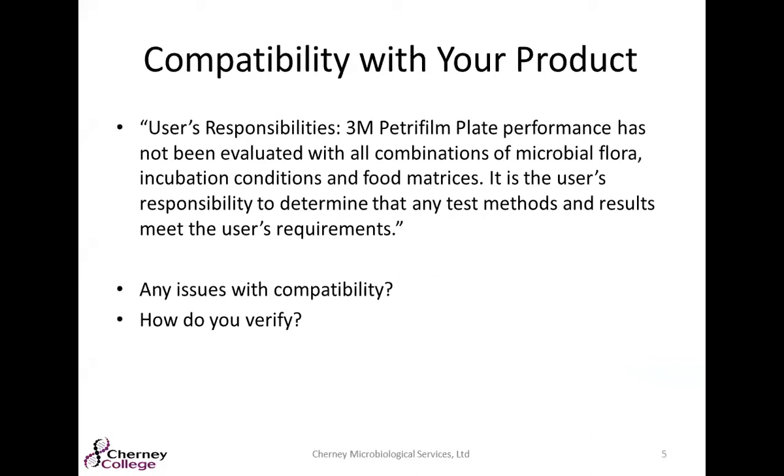Making sure that your product is compatible with 3M Petrifilm plate is definitely an essential part before you start working with your samples on Petrifilm. 3M says that obviously they can't have evaluated all food matrices, all combinations of microbial flora, or all incubation conditions. So it's the user's responsibility to determine that any test methods and results meet the user's requirements.